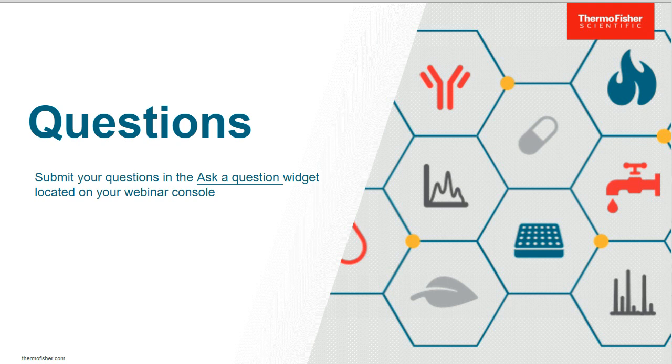So I don't know if I exactly get the question, so please feel free to add if I'm not answering this now. The main number of proteins that is falling in the interquartile range 1.5 is, at least for the 3 proteome mix, for the yeast almost 2,000 proteins. For the human, it's 2,400 proteins, and for E. coli, it's a little more than 400 proteins.